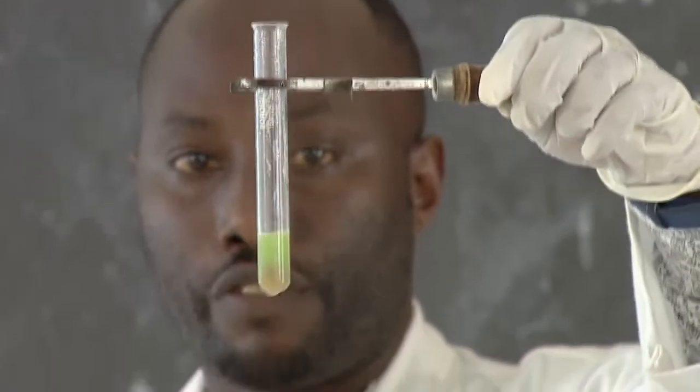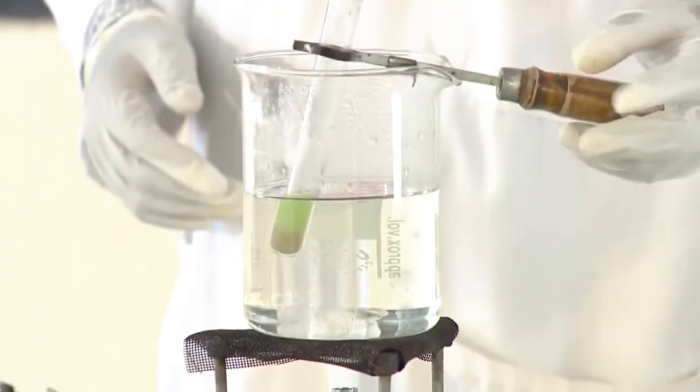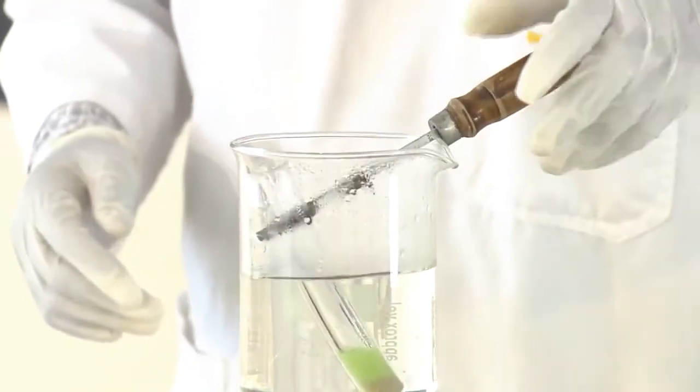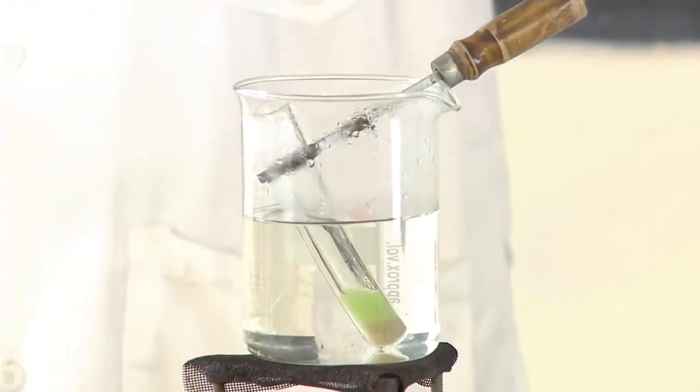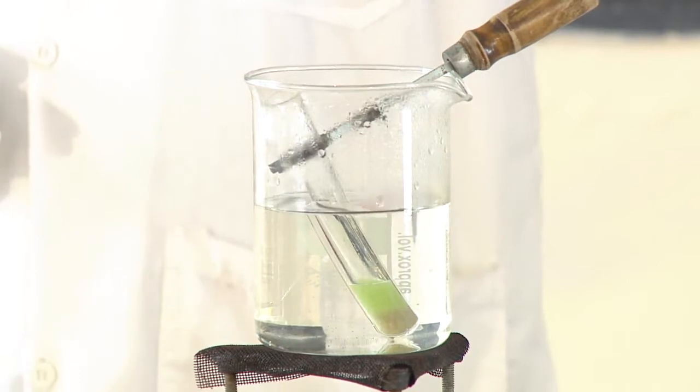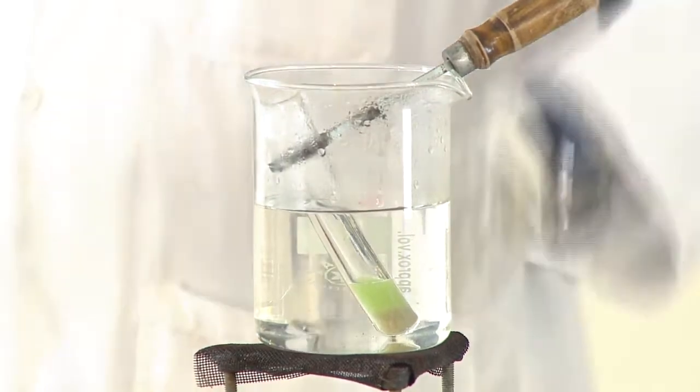We are observing it is changing from blue to green. So let us try to note something on the chalkboard, and then we write it. Meanwhile, we need to wait and see if it changes from green to yellow and finally to orange or moderate orange.